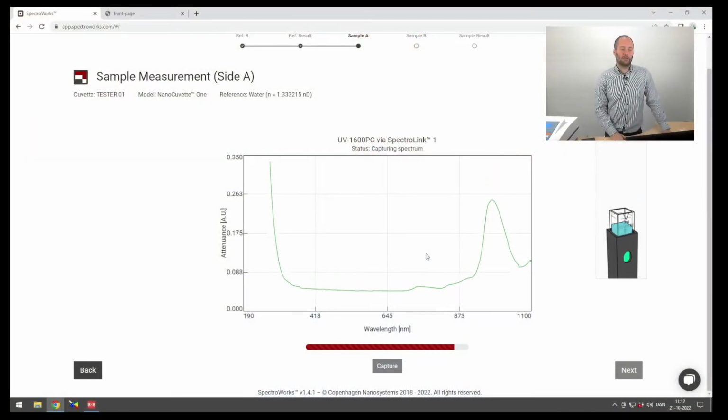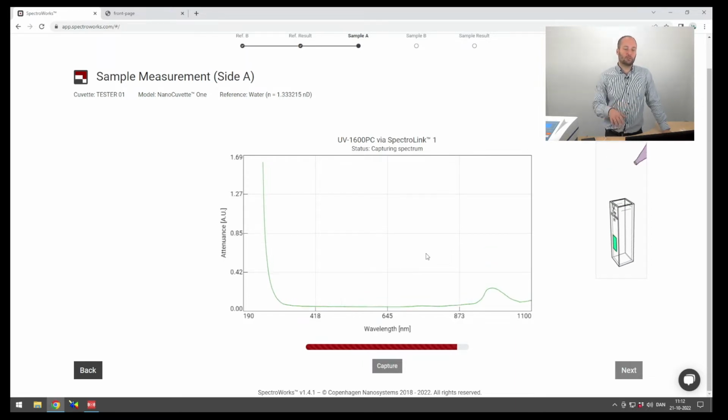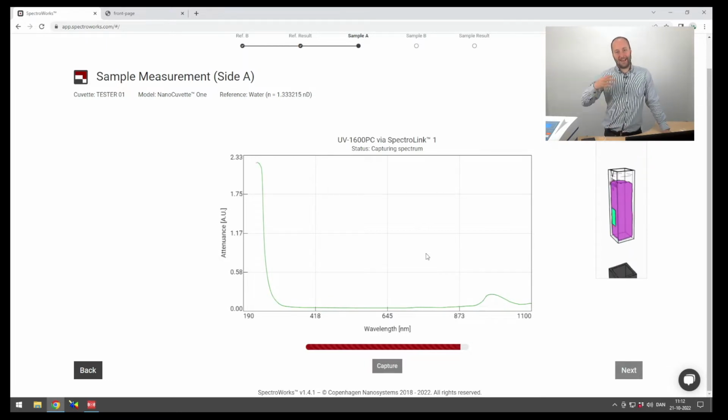Of course, if you were measuring the quality of wine, you would have a colorimetric response within the visible part of the spectrum as well. So that would just be added information that you can get from this spectral analysis.